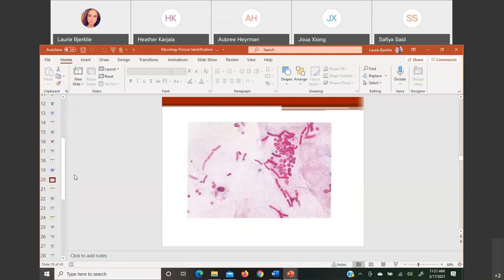Not coccidioides, that's a good guess because I can see the squares. I see what you were doing there. I definitely can tell that, but not that. Would you guys know it if I said spaghetti and meatball appearance? Does that mean anything to anyone? Sometimes people get questions on this, so I want to see. Yes, Malassezia furfur. Okay.